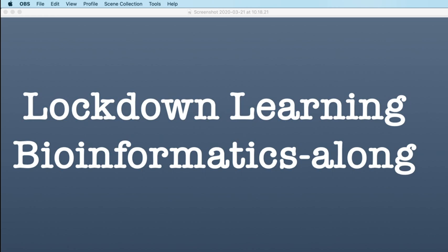So, yes, day 20. If you recall, yesterday we talked about the way that transcript level quantification works, at least roughly, a kind of global top level view of how that kind of quantification works. And then we proceeded to install a piece of software that does that kind of quantification. So we installed Salmon using Conda. And then the last thing we did before we left for the end of the day was start running the command to build an index for Salmon from our downloaded transcriptome.